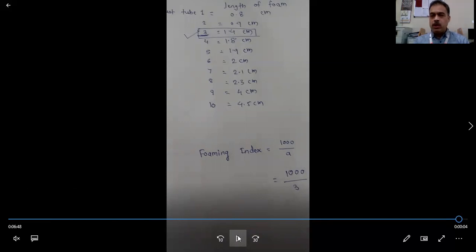If all the test tubes are showing more than 1 centimeter of foam, then the foaming index is more than 1000. If all are showing less than 1 centimeter of foam, then the foaming index is less than 100.